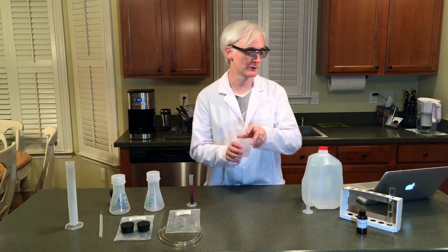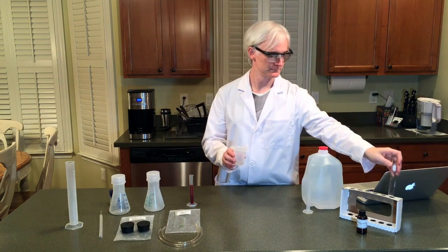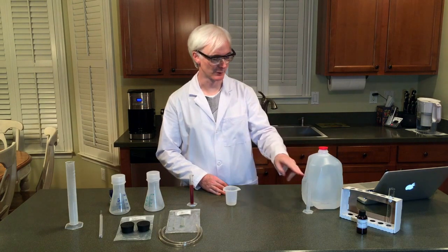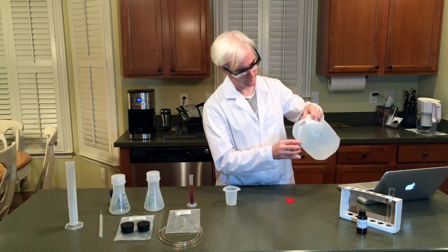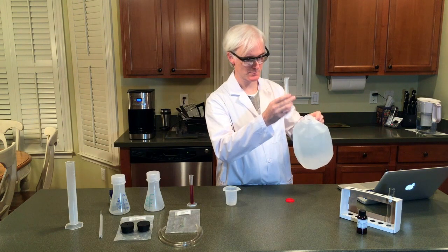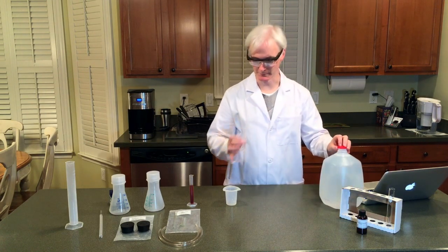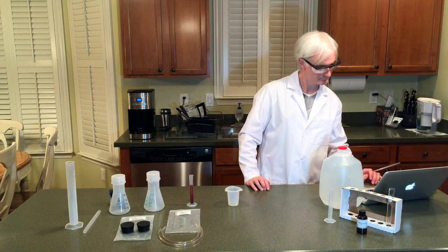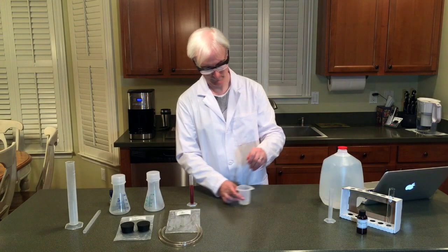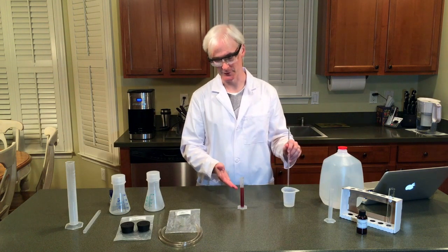Over here we have our 15 milliliters of hydrogen peroxide that I poured earlier. We're going to add that to a 100 milliliter flask. Now we're going to add 5 milliliters of distilled water to our graduated cylinder, just so we have it measured right. We're going to add this distilled water to our hydrogen peroxide. So now we have our two diluted solutions — one of the diluted hydrogen peroxide, and the other of our diluted iodine potassium iodide.